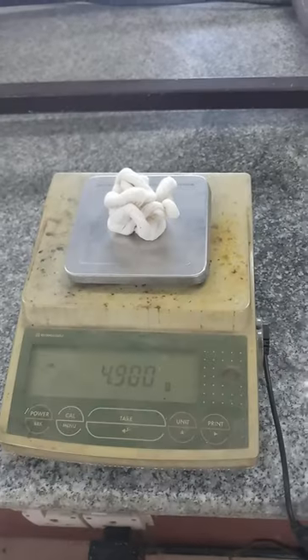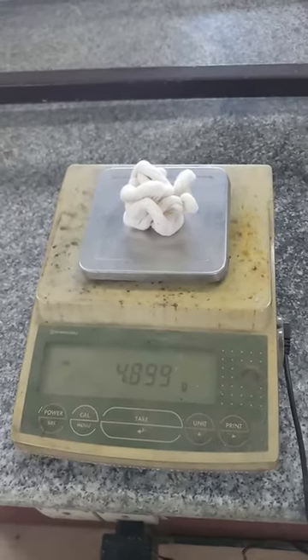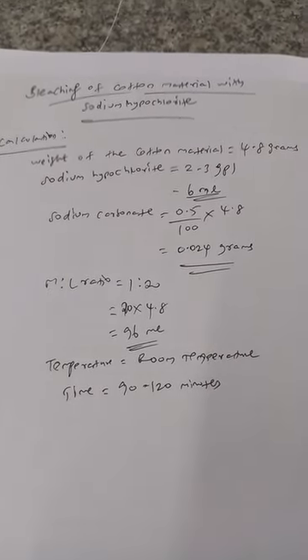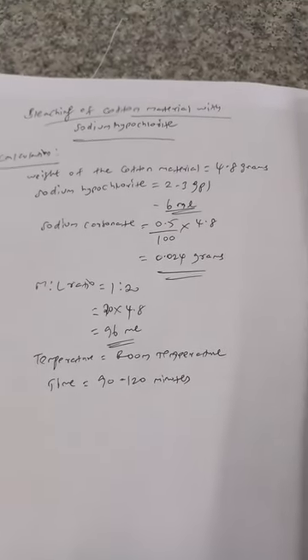We are going to do bleaching. For bleaching, we are going to take sodium hypochlorite. We are going to take cotton material in the form of leaf. The initial weight of the cotton material is found as 4.8 grams. For the weight of cotton material of 4.8 grams, we have to take 6 ml of sodium hypochlorite.